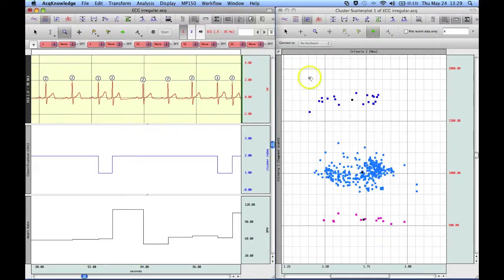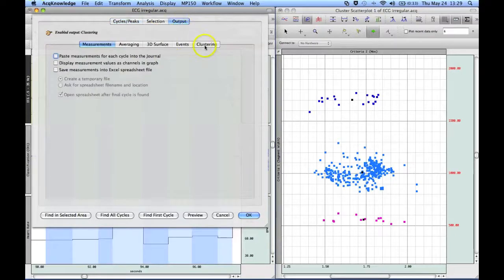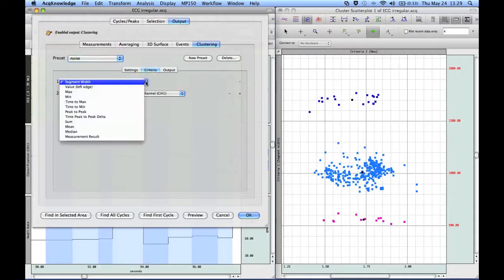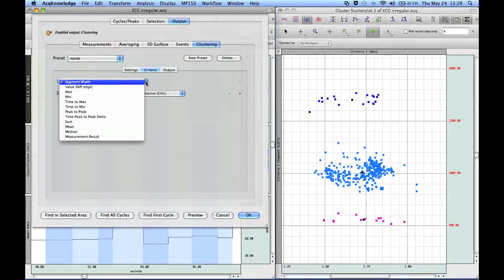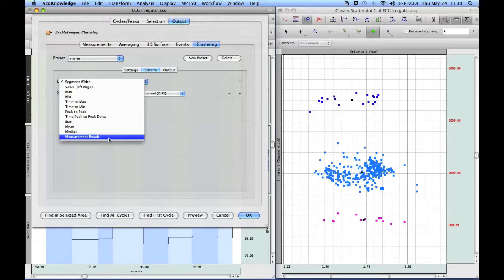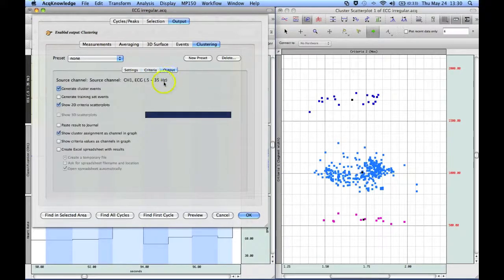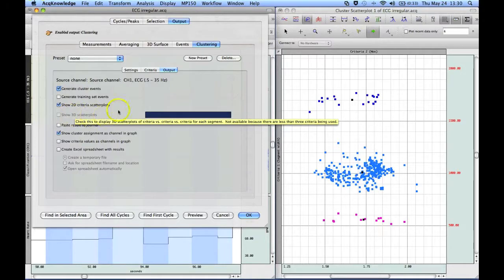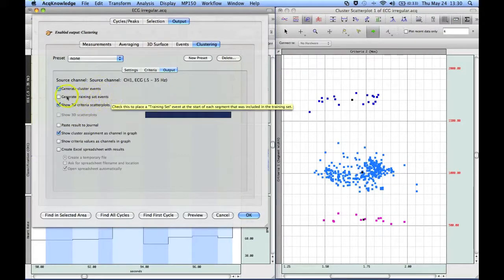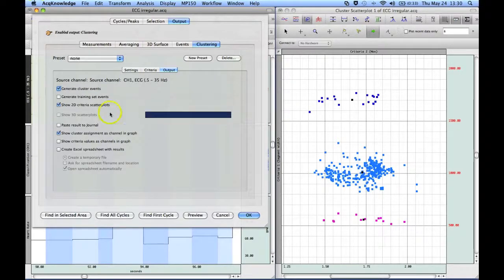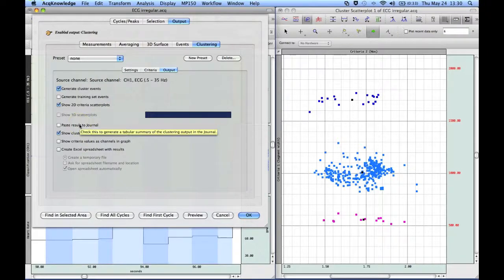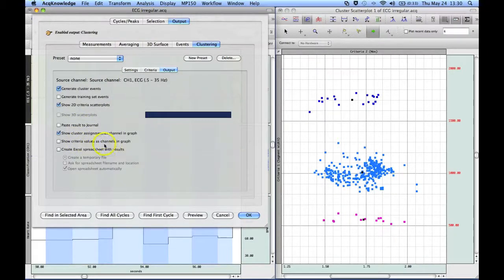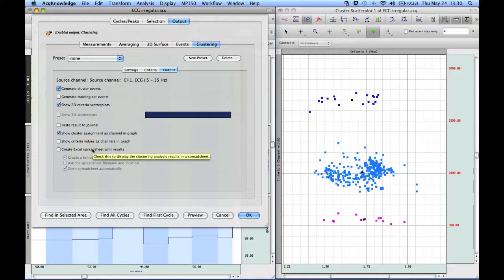And of course, you can use different criteria. If we go back into the detector and we go to our criteria, there's a whole subset of options you can use, including any measurements that you've got enabled in the software. So the ability to group them is really quite nice. And then your output. There are a number of additional options there. If you have three different criteria selected, you can do a 3D scatter plot. You can generate training sets of events so you can play around with the criteria for actually determining the groups. Paste your measurements down into the journal. Show the criteria values as channels in the graph. And then you can do the same with Excel as well.